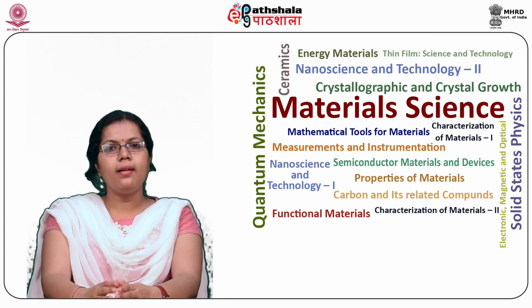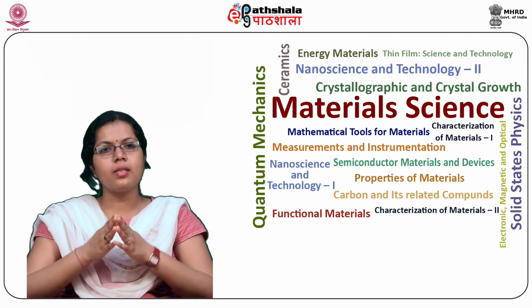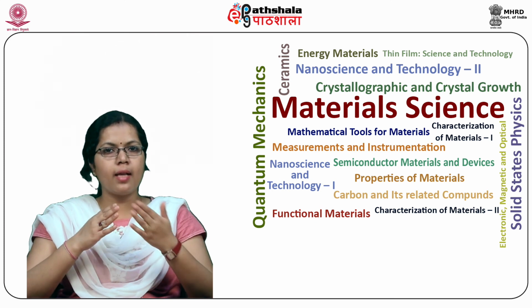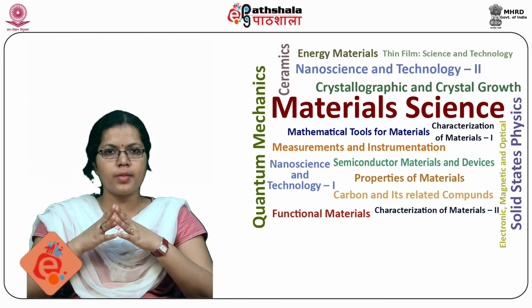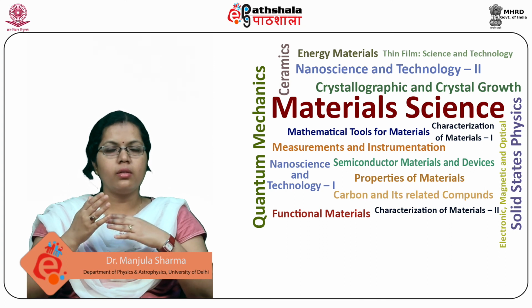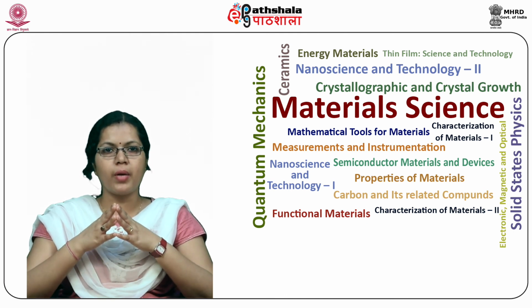So, students, let us summarize what we have learned in this module. We learned the principle of Raman spectroscopy. Then we discussed the different types of Raman spectroscopy, that is, surface enhanced Raman spectroscopy, tip enhanced Raman spectroscopy, coherent anti-Stokes Raman spectroscopy, stimulated Raman spectroscopy, resonance Raman spectroscopy, confocal Raman microscopy, and towards the end, we studied the instrumentation of the Raman spectrometer.